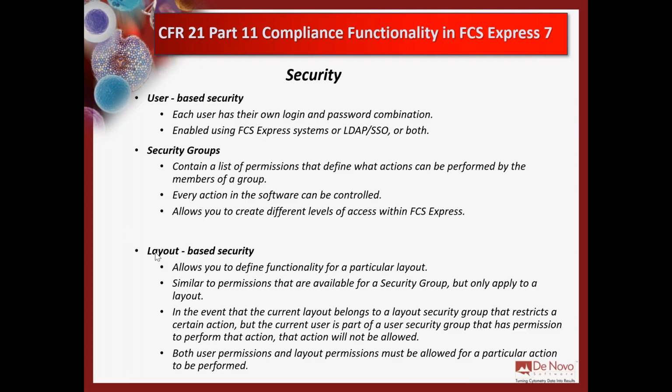Now, a very similar structure applies to the layout itself, your analysis template. So we have layout-based security, and that allows you to define functionality for a particular layout or analysis. So it's very similar to the permissions that are available for a security group, but they only apply at the layout level. And in the event that a layout belongs to a layout security group that restricts a certain action, but the user is part of a user security group that has permissions to perform that action, the action won't be allowed, right? So it's kind of two different levels of security.